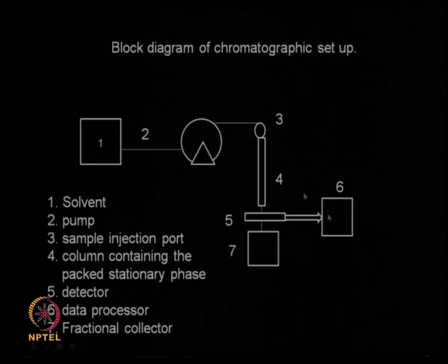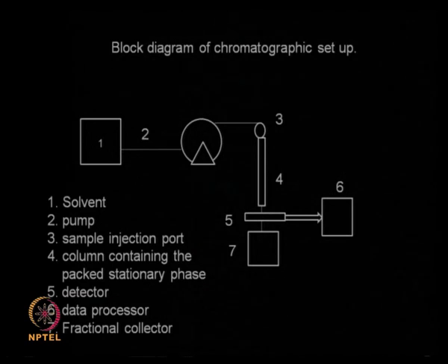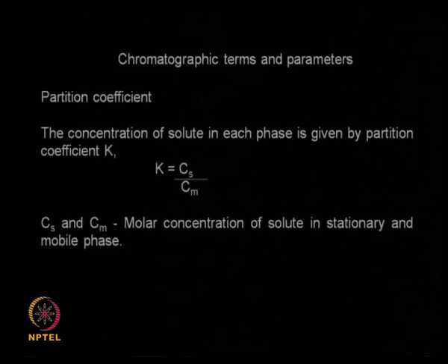We can collect each of the fractions that come out, and then do further processing of that fraction. We can further purify it, or we can do analytics to find out the nature of the protein, or we can take it for further downstream processing as well.